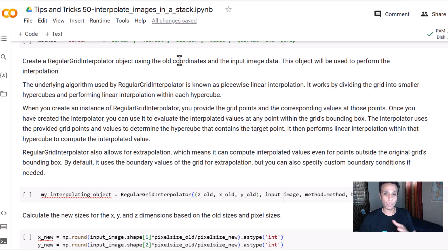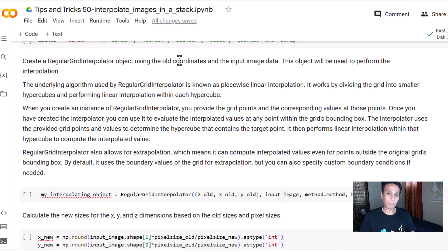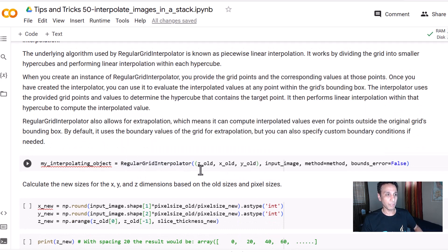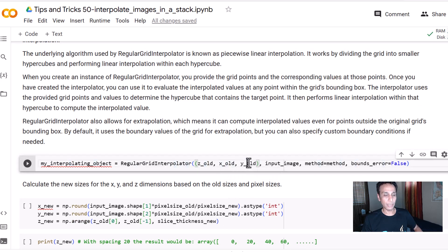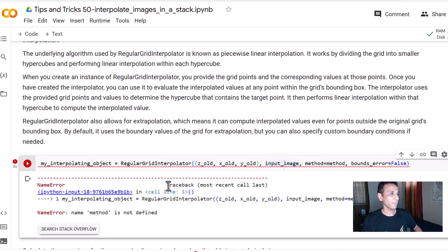Now let's create the RegularGridInterpolator object using the old coordinates and the input data. You have your old coordinates and old pixel values, so you create this object so it knows the space it's working with. When you insert new data — whether in z, x, or y — it has values to interpolate with. We pass z_old, x_old, and y_old coordinates, the input image for pixel values, and method equals linear.